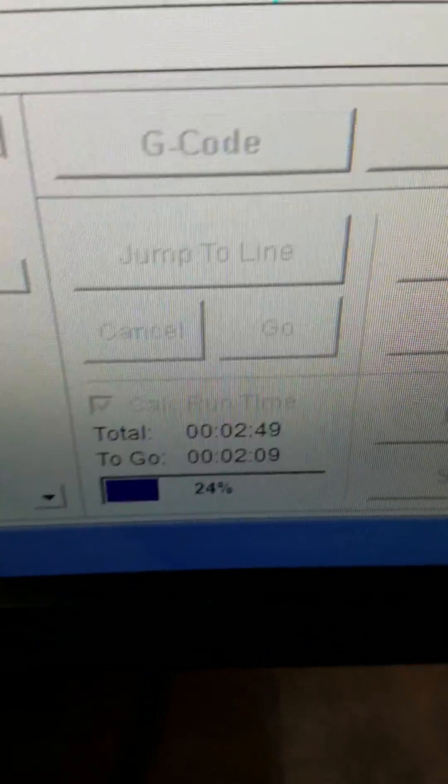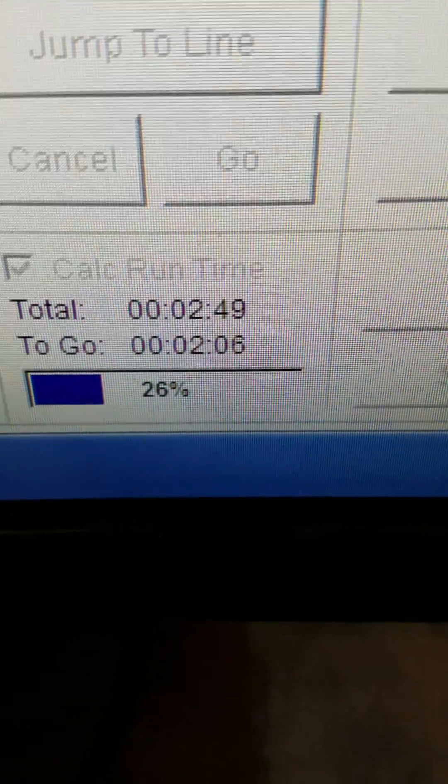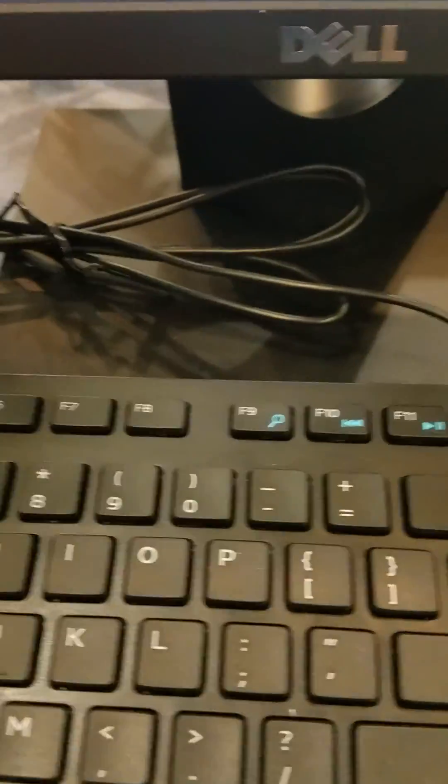You can track it by how long the total for the program is and how long it has left to go. And anytime you need to hold it, you just put any key on the keyboard and it will pause the machine. I'll demonstrate that for you now.